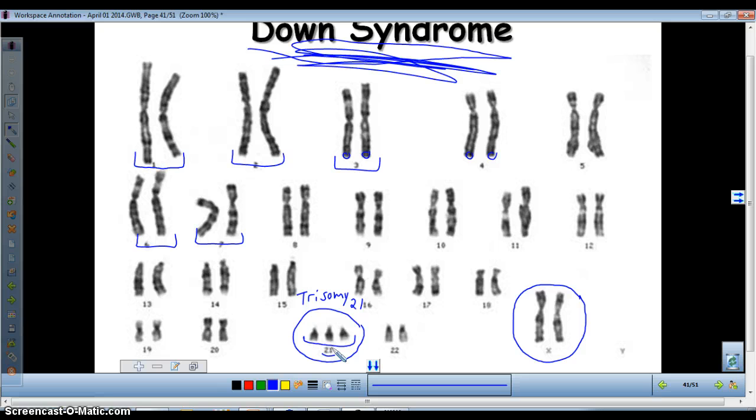The way you use karyotypes is you look at the chromosomes. If you find any abnormalities like trisomy, you can have trisomy 21, you can have trisomy 13, and you can also tell the gender of the individual based on looking at their sex chromosomes.